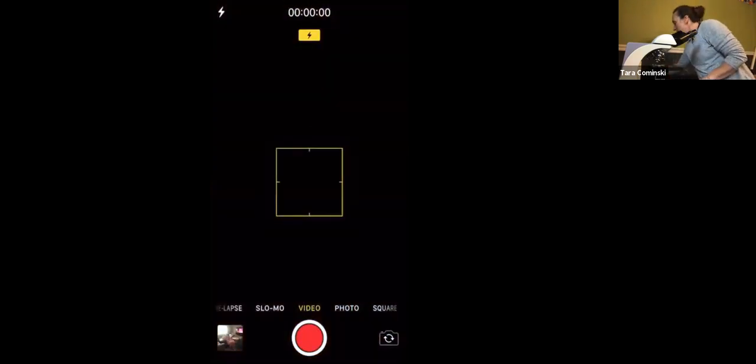So if you guys go to page 21, under the inversion part, okay? It says draw the letter E as it appears on the slide. So meaning by the unaided eye, it's just going to look like a normal letter E, okay? Let me do something here. I'll show you what it looks like. 1 second.